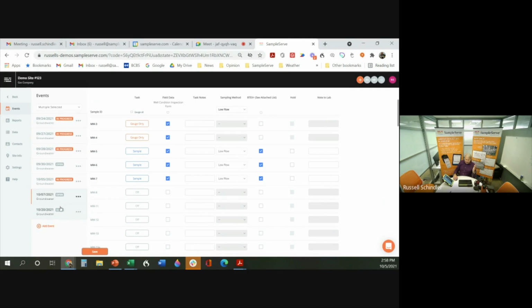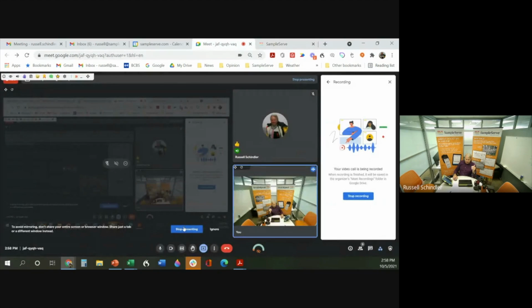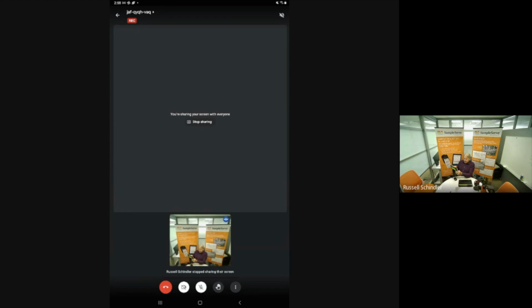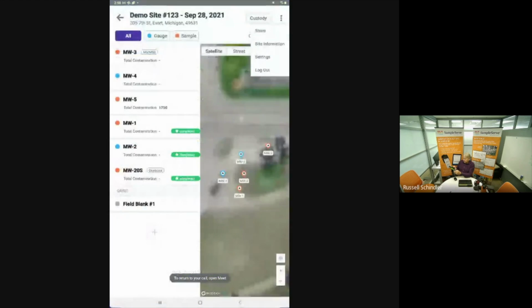So I've hit save, and now I'm going to show you the app. So let me switch over. I'll stop sharing this. I'm going to now share my screen here. So you should see that here in a second. So I'm sharing my screen. I'm going to the app.